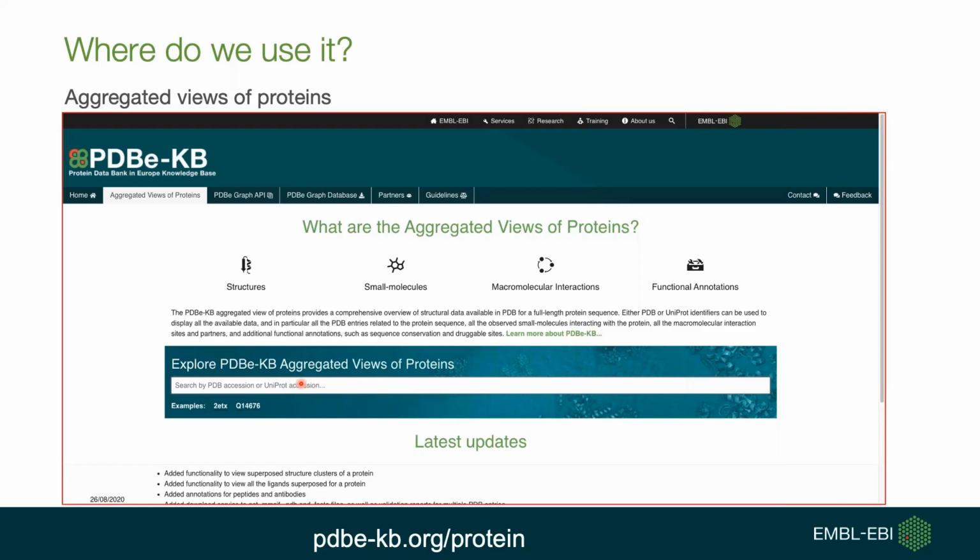If you're interested in a particular PDB ID or UniProt, you can search for it from this text field. Next, I'll take you through some of these components and the corresponding API calls which are used to render this information.